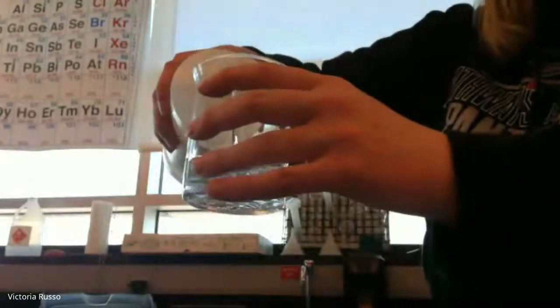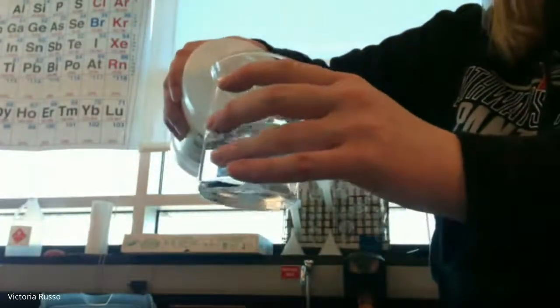So if we get a beaker, I just want to show you what this reaction looks like. So I'm going to pour a lot of hydrochloric acid into the beaker. And I'm going to take a big piece of metal and put it in there. So this is what was happening during the lab. And if you look here, you can see the bubbles being produced. So that's the hydrogen gas. And you can see it being produced from the top. You can see it's coming off the ribbon.